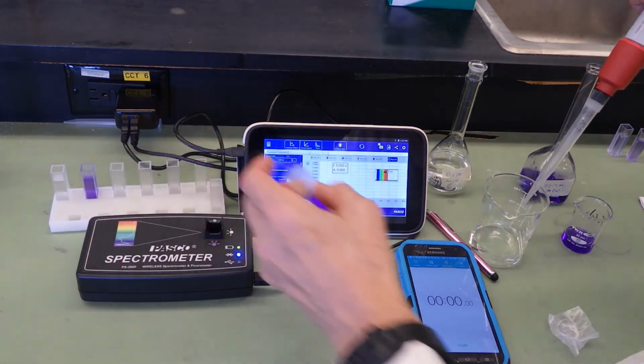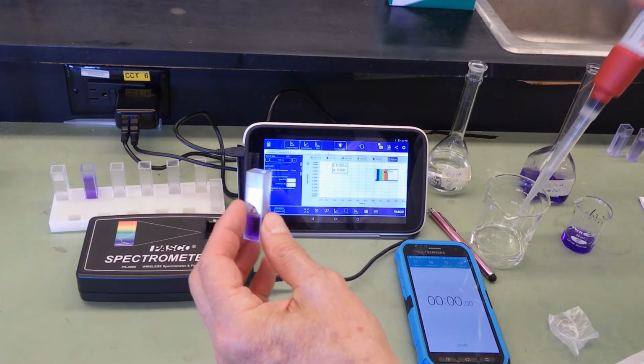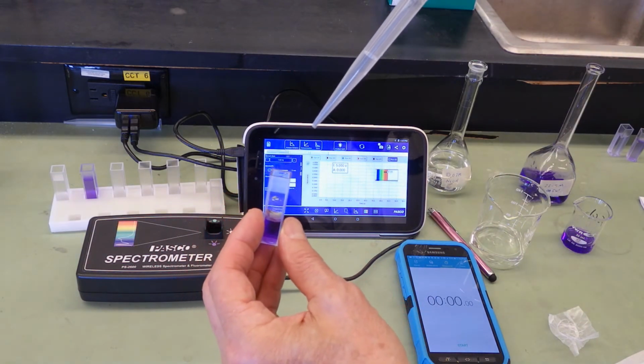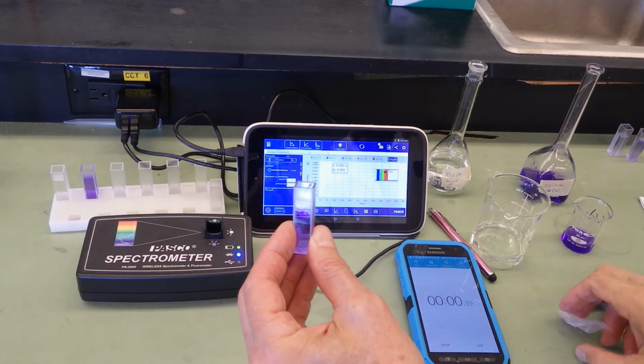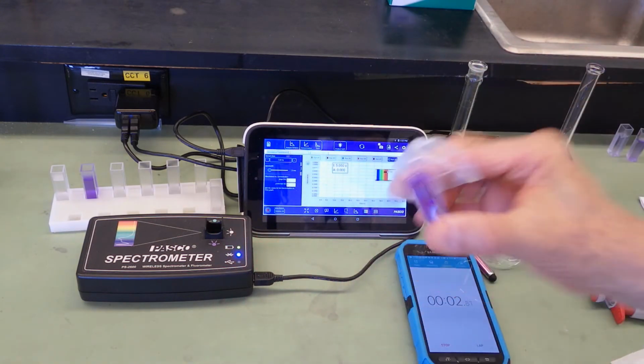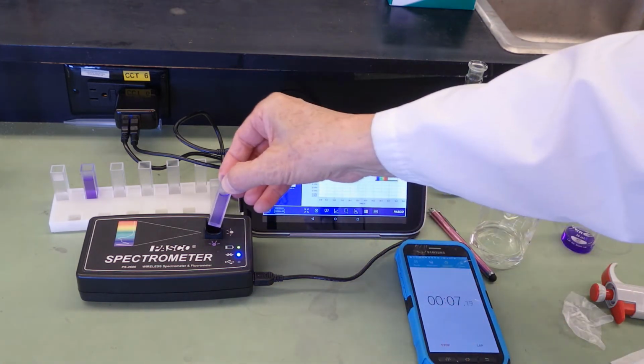And as soon as I add that sodium hydroxide, I'm going to start that timer immediately. Your partner can press the timer as you add this right now. Now I'm going to mix that 3 or 4 times, as quick as I can, and put it in the spectrophotometer, and then I press the record button right at the 10-second mark.